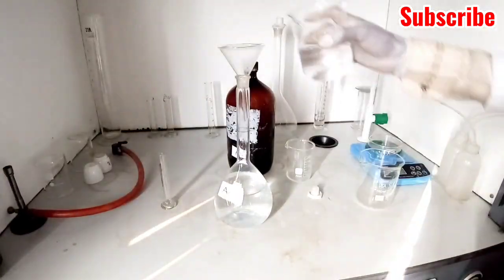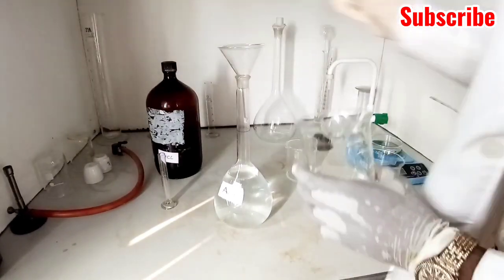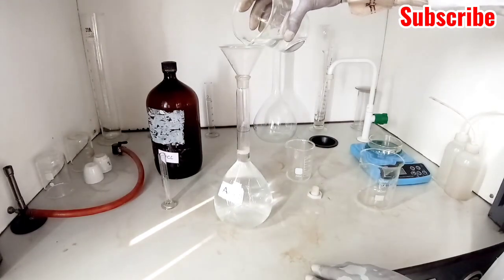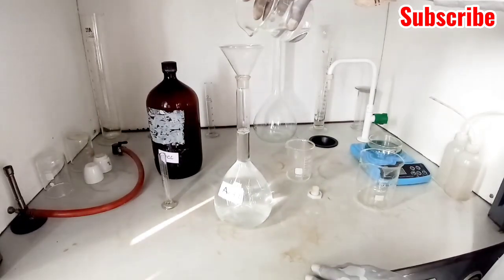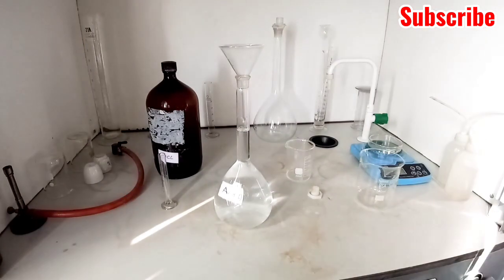Rinse it to remove more quantity from it, and now you dilute to the 1000 mark. It has a mark there, I believe you can see it. So that is per dm cube. So this is 0.102 mole per dm cube of hydrochloric acid.